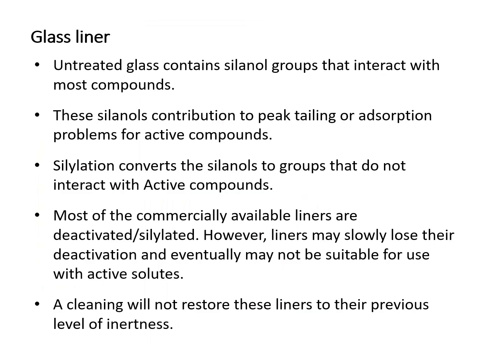A glass liner is usually untreated glass, which contains silanol groups that interact with most compounds. This silanol contributes to peak tailing or adsorption problems for active compounds. Therefore, silylation converts the silanols to groups that do not interact with active compounds.